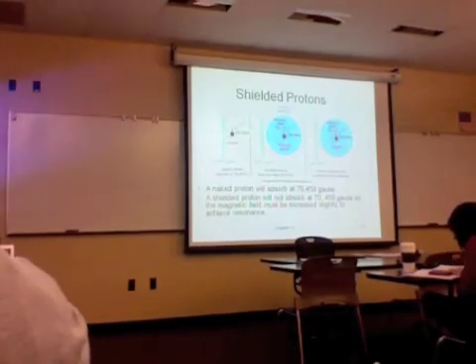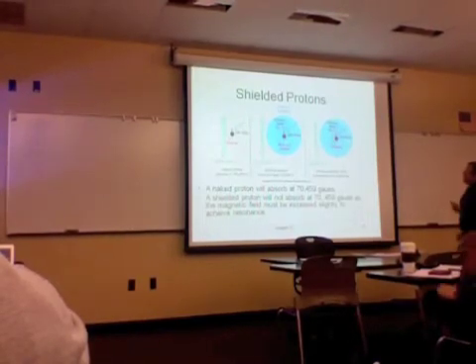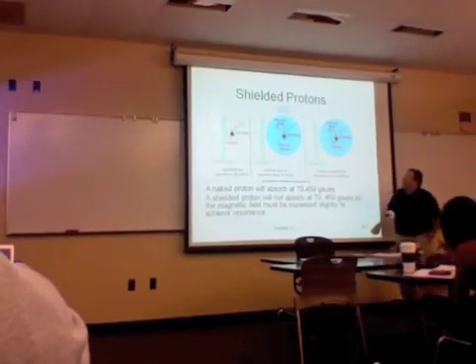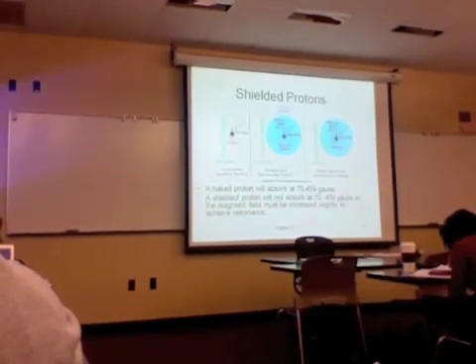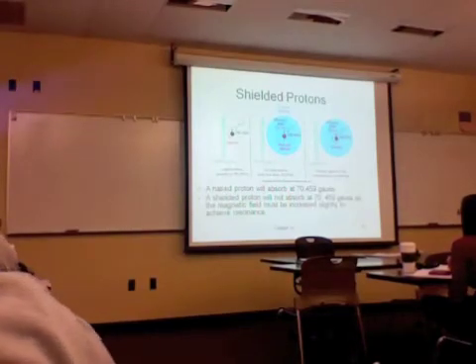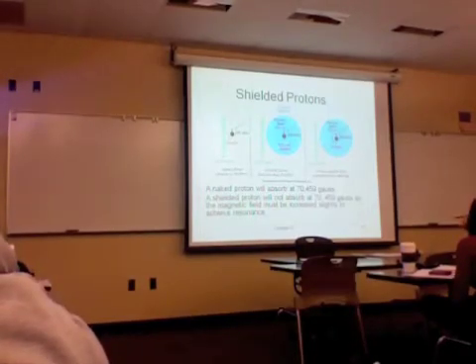Does that make sense? So now my proton doesn't give a signal because the energy difference is different, because the magnetic field is different. So now I have to increase my magnetic field to 70,460 in order to get the proton to experience 70,459 and signal. And our instruments are finely tuned enough so that the difference between 70,459 and 70,460 is detectable. And I can see it as a shift in where the proton is getting excited. Does that make sense?